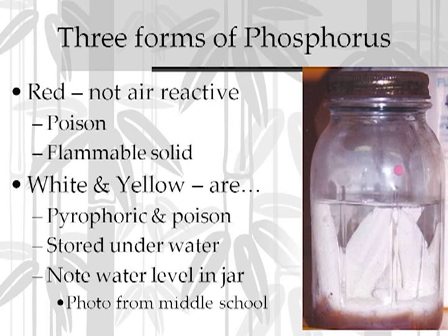They're generally stored underwater. And in the photo you see here of the ball canning jar with the white phosphorus in it, note the rust on the cap. What's happened is that the phosphorus that's in there, and this is about 1/2 pound of phosphorus, which is a lot of white phosphorus, has reacted with the water and created a mild acidic solution, which has reacted with the metal cap and rusted it. So you've got a material that reacts with air, can spontaneously ignite, is stored in this case in a middle school underwater, but it's got an open lid with the rust holes in it.